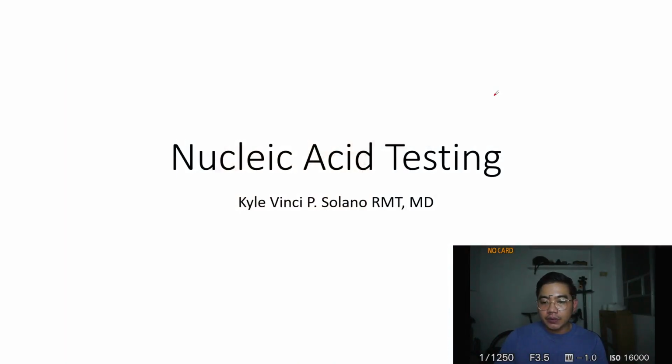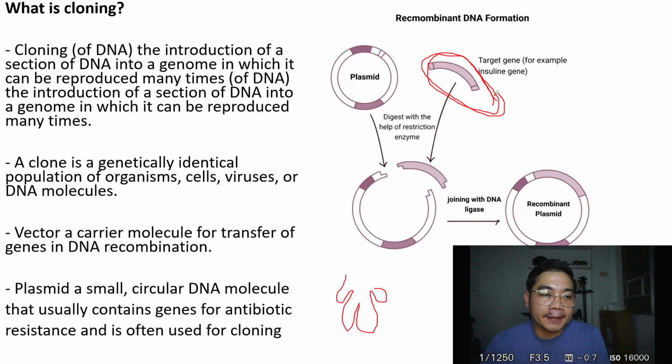So, there are other ways to do nucleic acid testing apart from the things that we will discuss tonight, but I will talk about the most timely tests, like your PCR. We also have your northern blot, western blot, and southern blot, which test for different types of biomolecules. But we're just going to focus on PCR tonight. So first, what is cloning?